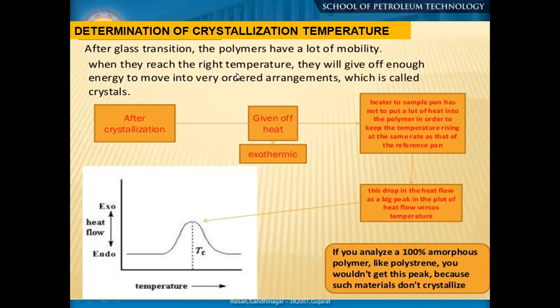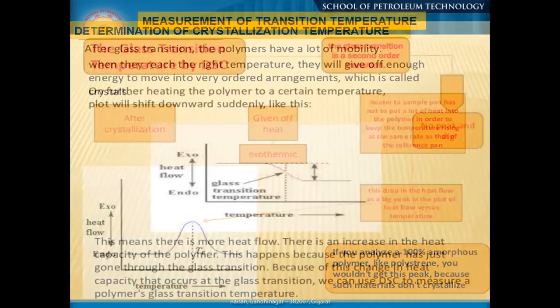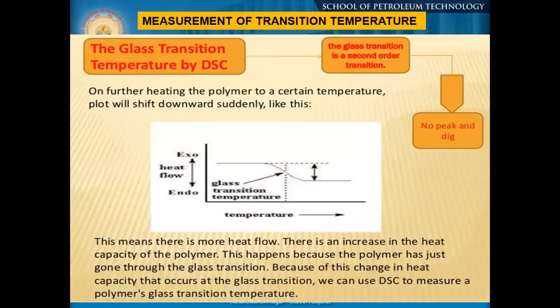So what is happening is that the DTA and DSC graphs are giving us certain information regarding the phase change. Transition temperature: you can also see there is a slope change right from here to here. That means the internal structure is changing. The internal structure of the system is completely changing. That's why we can properly measure it. And what temperature are we fixing for the transition, because you see it starts from here and ends here. So that means there is more heat flow.